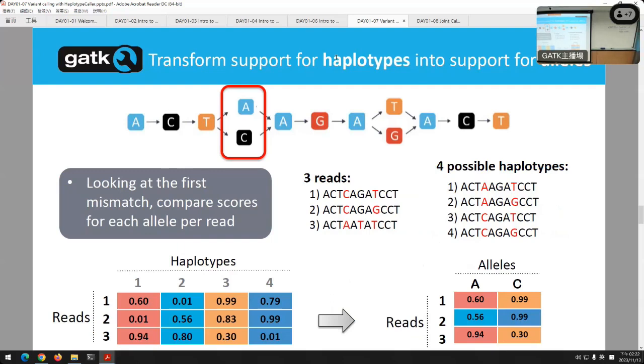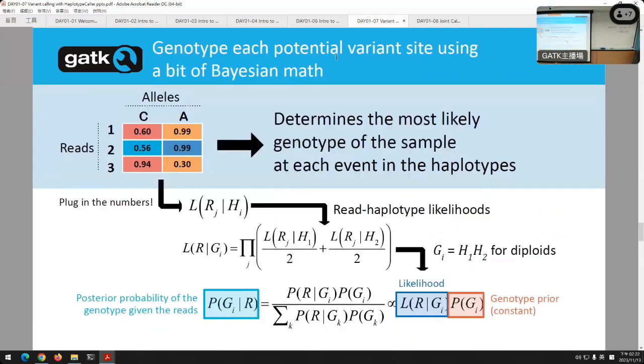I'm going to throw this into our math. I'm not going to make you understand every bit of detail of the equation, but this is simply Bayesian mathematics. It's Bayes' law. I'll jump down to the bottom to start with. Bayes' law gives the posterior probability, and that adds up to 1. It's the prior probability times the likelihood.